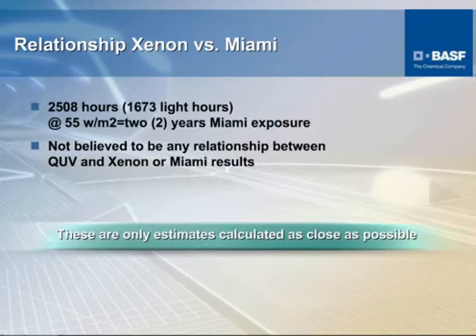The question always comes up, just exactly how do you relate what you generate as far as data accelerated to actual Florida? Is there an equation? Well, truly there isn't. What we're doing accelerated is very controlled. What is happening in Florida or Arizona is dependent upon weather shifts. What we can do is we can estimate based upon years and years of accumulated data that the general J1960 type exposure generally mimics as close as possible to approximately 2 years in Miami. But that depends upon the weather conditions in Miami over that 2-year period.